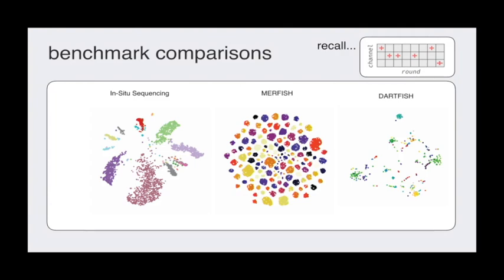So here are t-SNE plots of those spot traces across 3 different assays, color-coded by the gene identities. So what this tells you is, for example, for in situ sequencing, all these green spots correspond to some gene, and so do these purple spots, and there's some nice separability in this low-dimensional representation of the data, which gives you a sense of the SNR, like what is my ability to actually process these data to decode what the gene identities were.